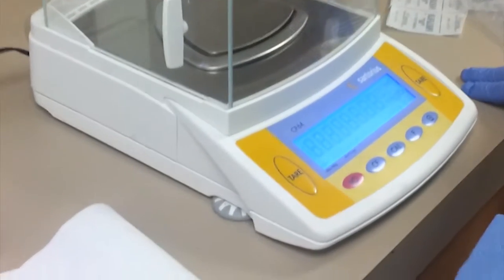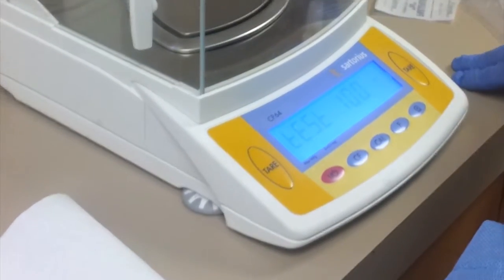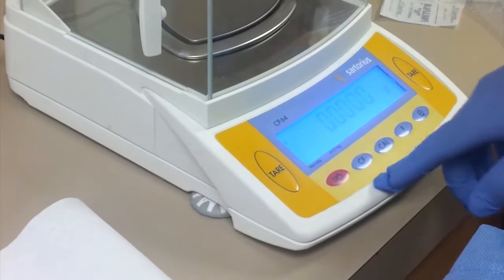The first thing we want to do is power on the balance. As you can see, the scale should read zero grams.